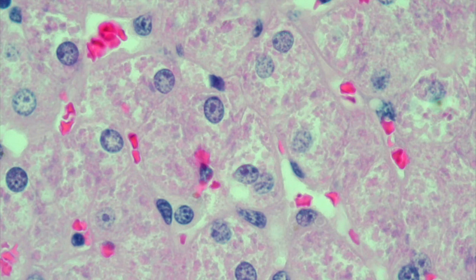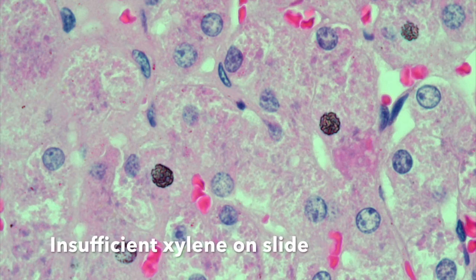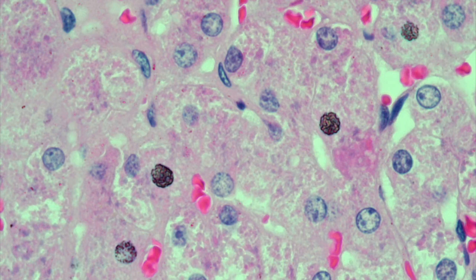So now compare that to the next slide, where if you observe closely you'll see that some of those nuclei now look black, and this is simply due to having allowed too much of the xylene to evaporate from the surface of the slide before it's brought down onto the mounting medium. So best as we can understand, as more of the xylene has evaporated, that's resulted in small air pockets within the detailed chromatin structure within those cell nuclei, and then as those air pockets get trapped beneath the layer of mounting media, when you look at it under the bright field microscope, it's having this effect on the optics such that those areas look dark when they should be looking just as blue as those other cell nuclei.